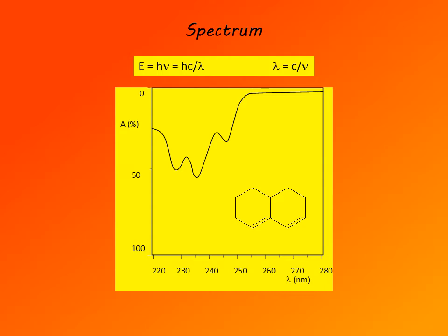Ultraviolet visible spectroscopy has relatively low information content compared to other spectroscopic methods. Also, not all compounds are active in this type of spectroscopy. Not all compounds absorb ultraviolet and visible radiation. This method is limited typically to unsaturated compounds, and also the actual spectrum depends on the solvent and may change from one solvent to another. So this type of spectroscopy has rather limited application.